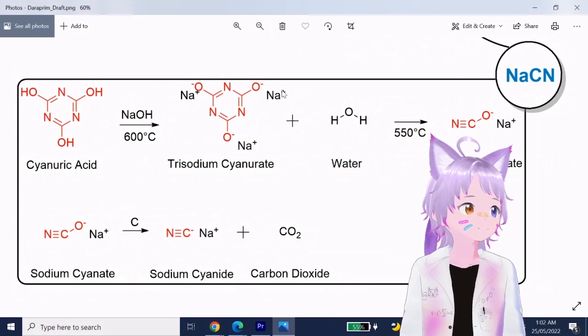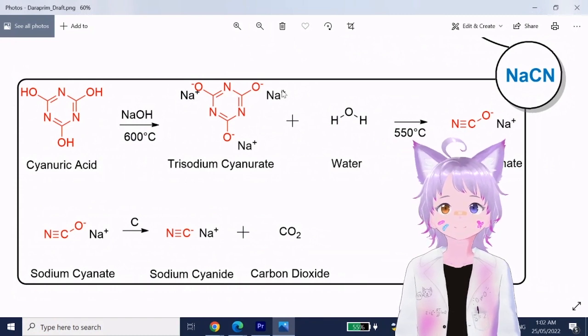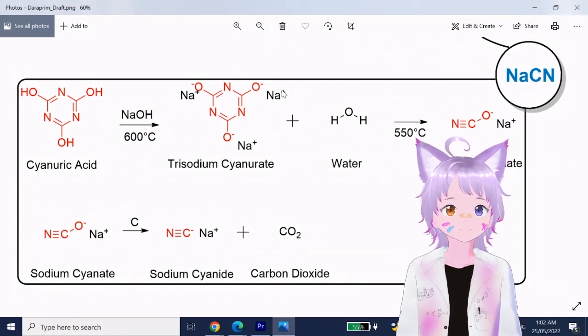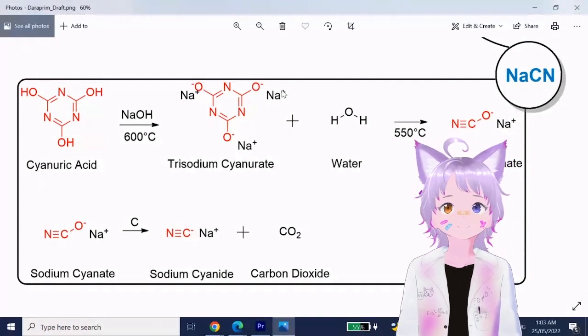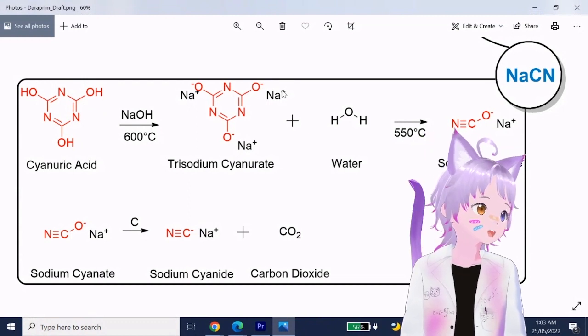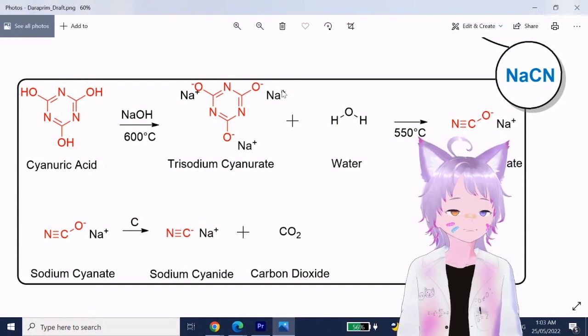If we figure that out, we could make synthesis grade sodium cyanide from a homemade thing that isn't messing with iron cyanide salts, which, granted, is the best way, but I don't really want to filter goop because the Prussian blue is going to be like a thick goo. But this is a possibility. Yeah, I know, it's not that bad, but when you make it, you end up with this, you know, that's another option. Or yeah, we can do this two-step furnace option.